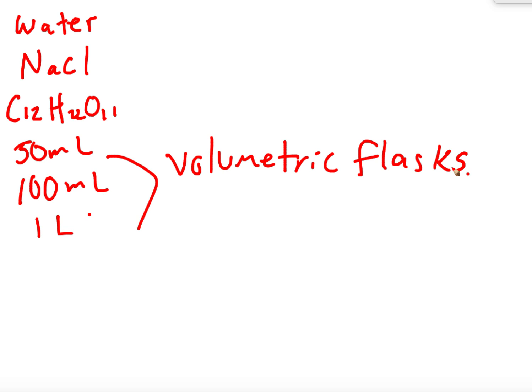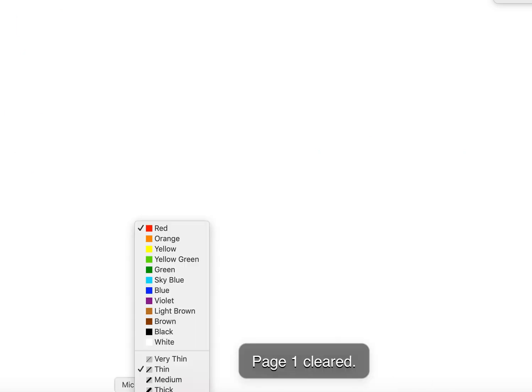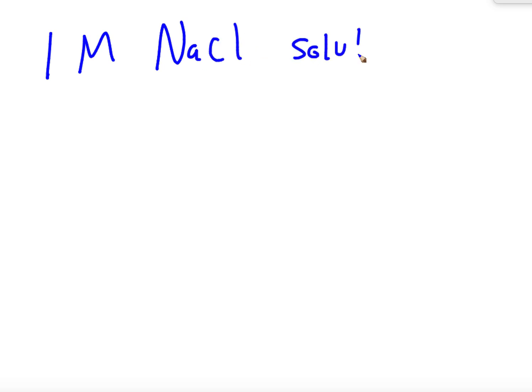Okay, so I'm going to show you how to prepare a solution. So for example, say I wanted to prepare a 1 molar NaCl solution in a 1 liter volumetric flask.